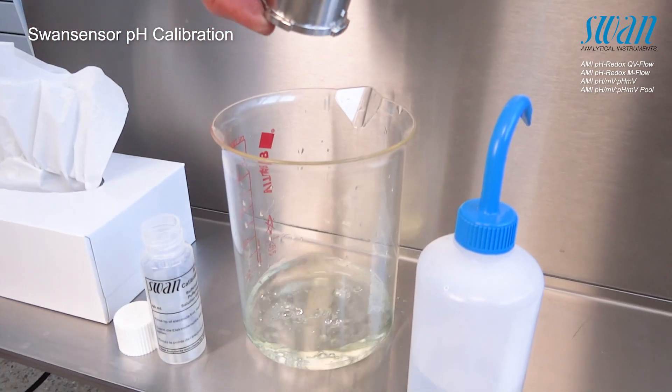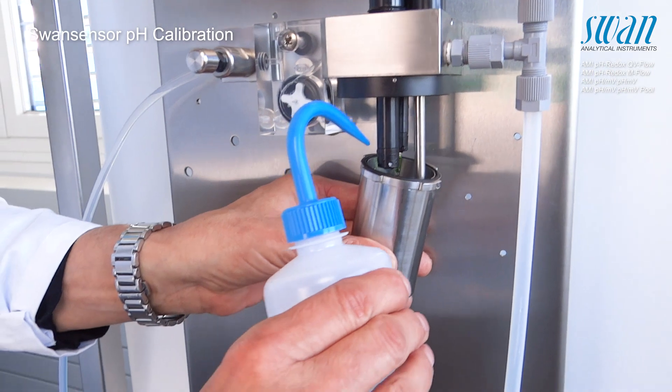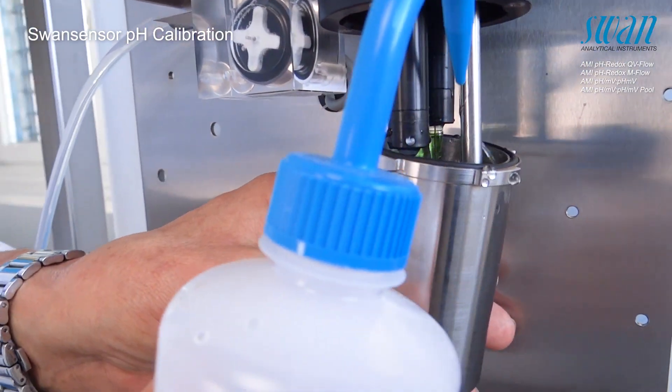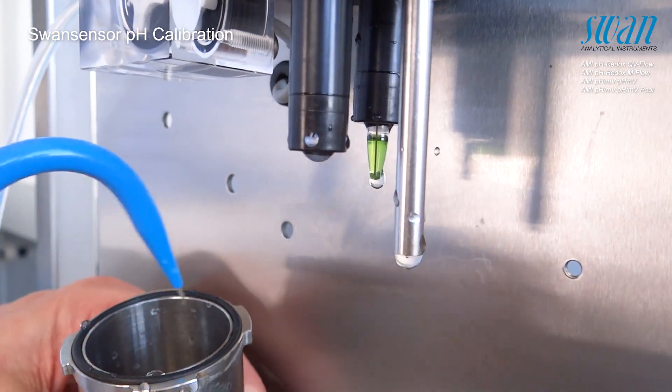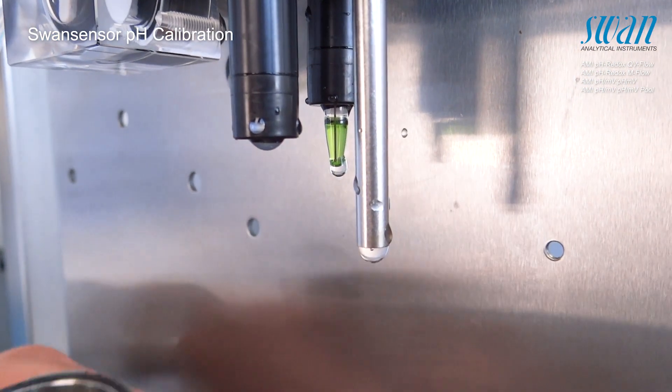Discard the contents of the calibration vessel. Rinse the electrodes with deionized water and pat them dry with a soft paper tissue.